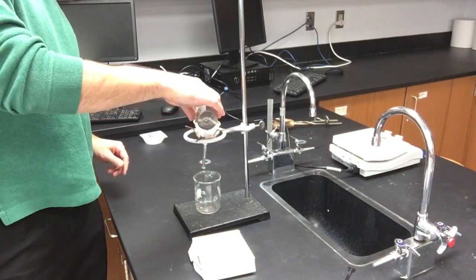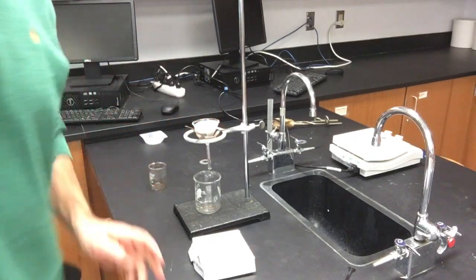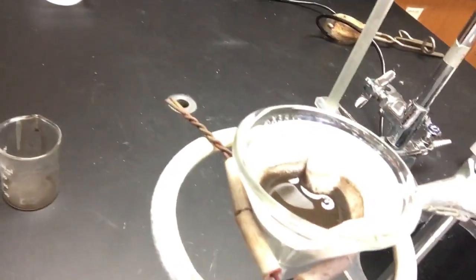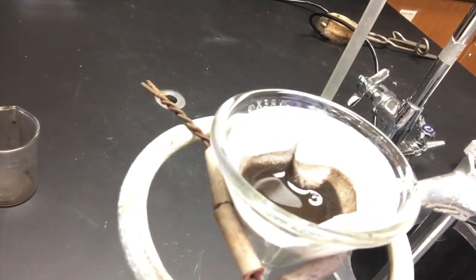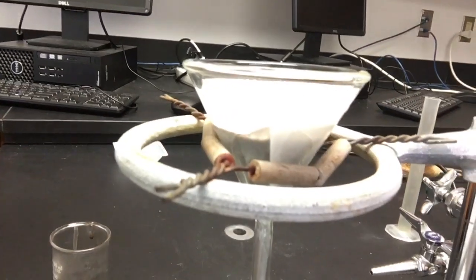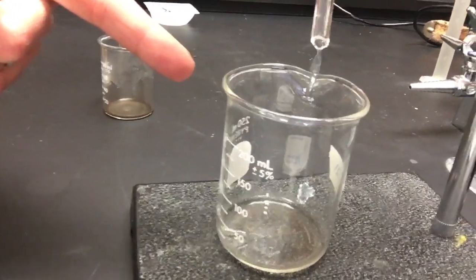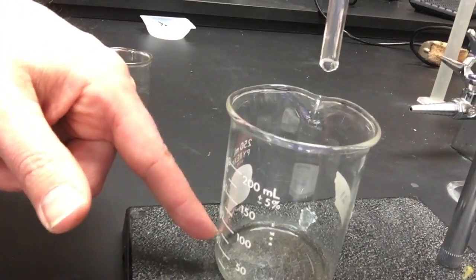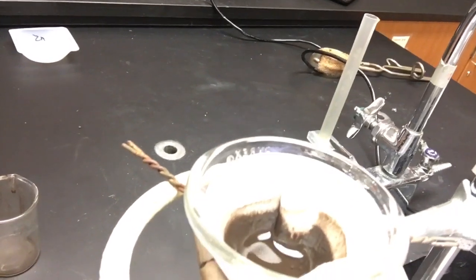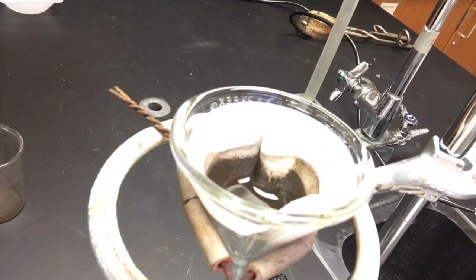I'm going to pour the rest into my filter paper. It's a slow process, and so all that copper gets stuck in the filter paper — it stays on top — but all the water and other liquid chemicals go right through. So this is the water portion and any leftover acid chemicals; up here is where all the copper is — this is the copper oxide. It's going to take a little bit of time for this to finish.